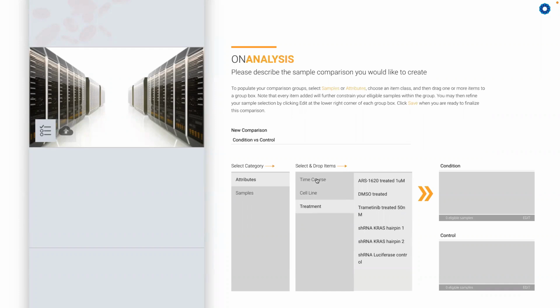So here we're going to go ahead and get started with treatment. So let's say that I want to take a look at, let's do ARS 1620 versus DMSO. And notice as soon as I did that, that just filtered down.